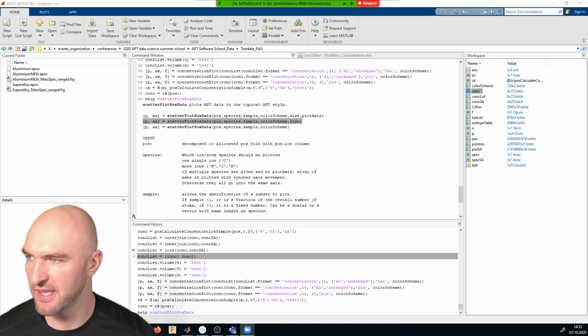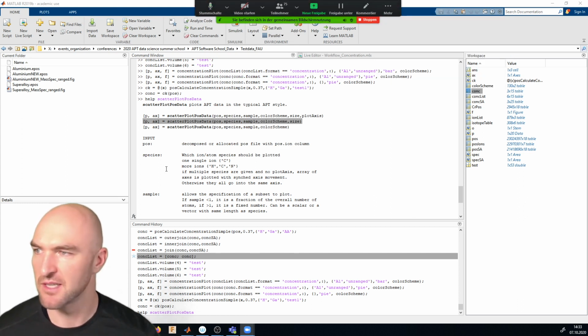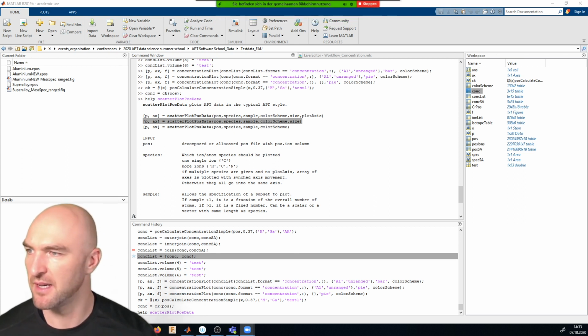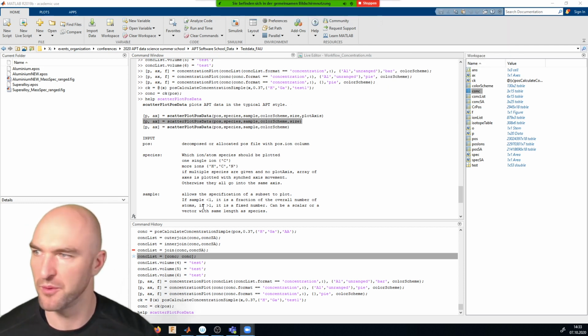Okay, you might just have some black flickering on top of the toolbar here. So apparently you can't have both at the same time. It's a bit of a nuisance. In the video, there shouldn't be a problem at all, if you rewatch it later.